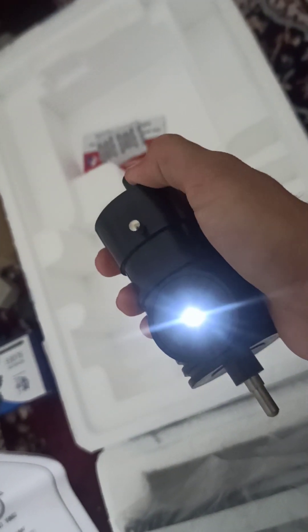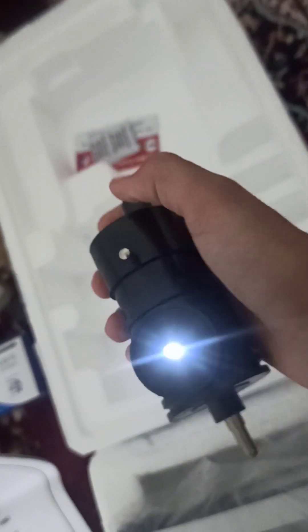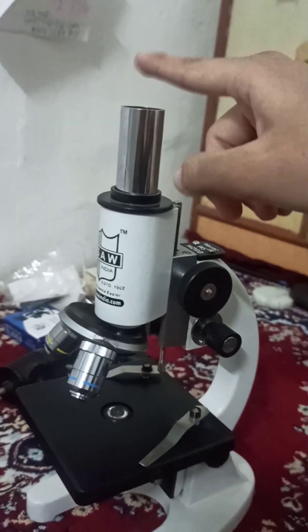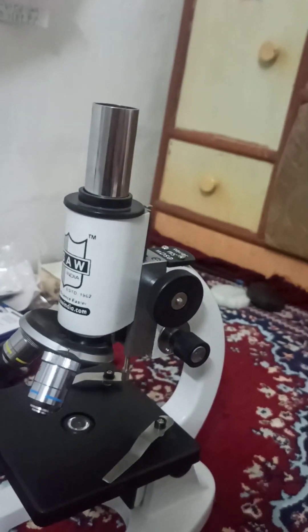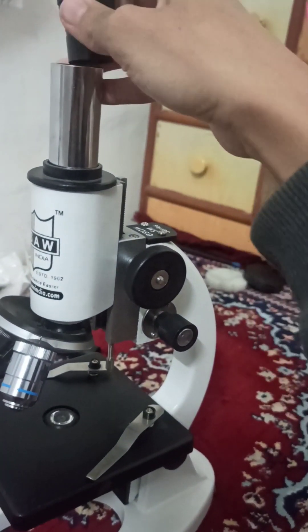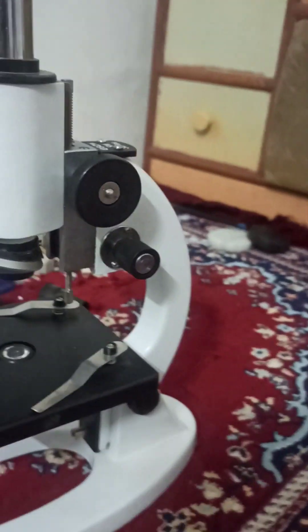For the LED, you can turn it on and also adjust its intensity and strength using this knob. Here is the microscope, and for the upper part, you have to put any of the lenses provided. I am putting the 10x wide field lens.